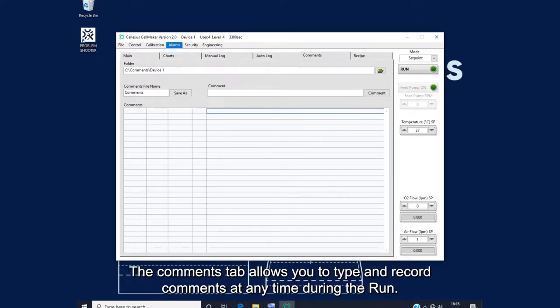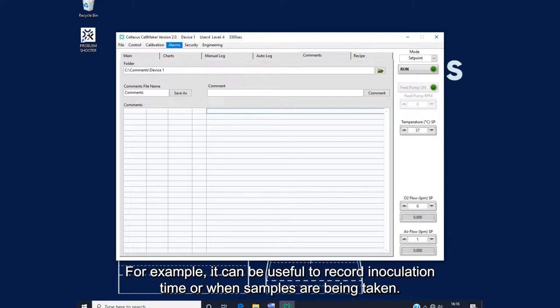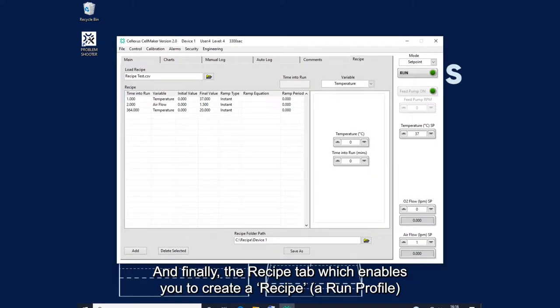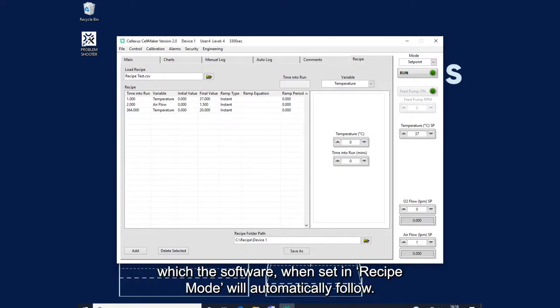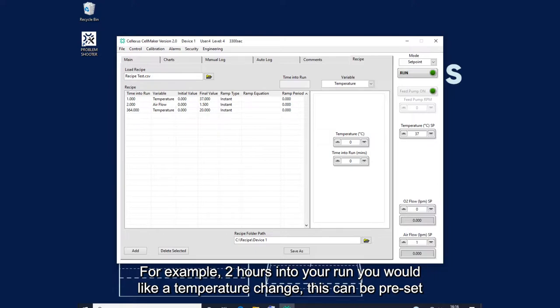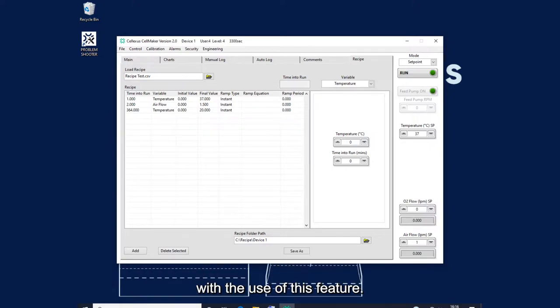The comments tab is to type and record comments at any time during the run. For example, it can be useful to record inoculation time or when samples are being taken. And finally, the recipe tab, and this enables you to create a recipe or a run profile, for which the software, when setting the recipe mode, will automatically follow. For example, two hours into your run, you would like a temperature change. This can be preset with the use of this feature.